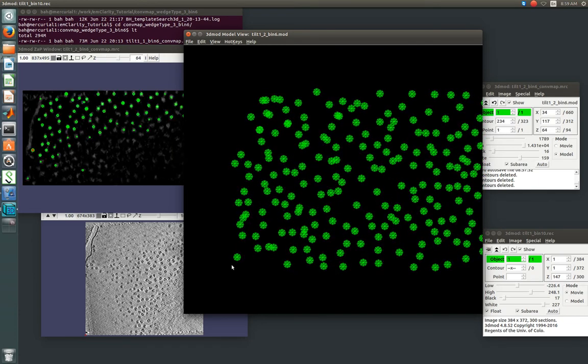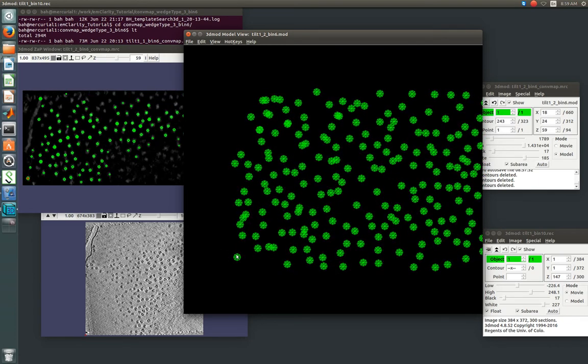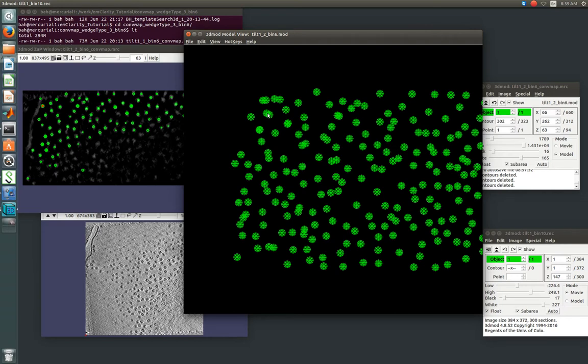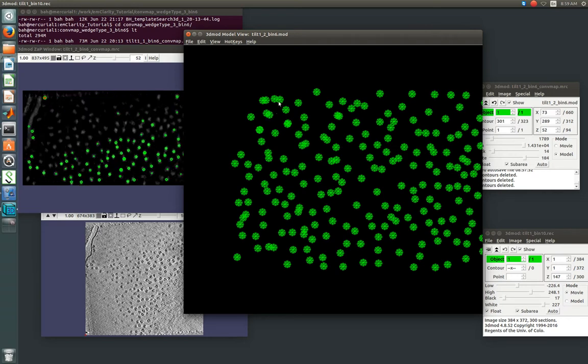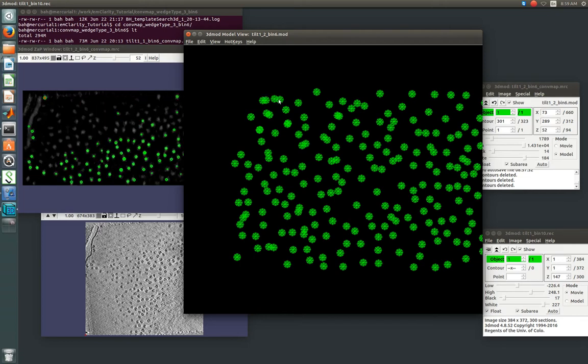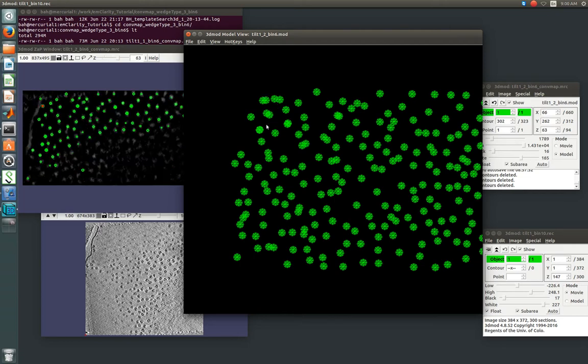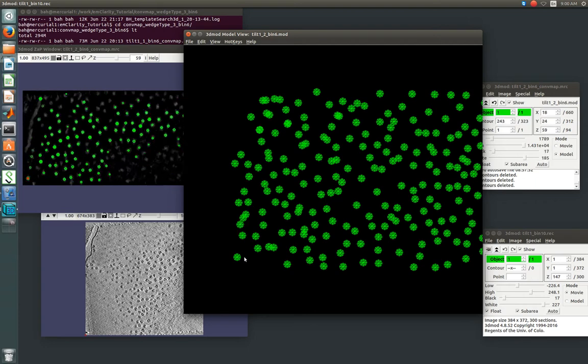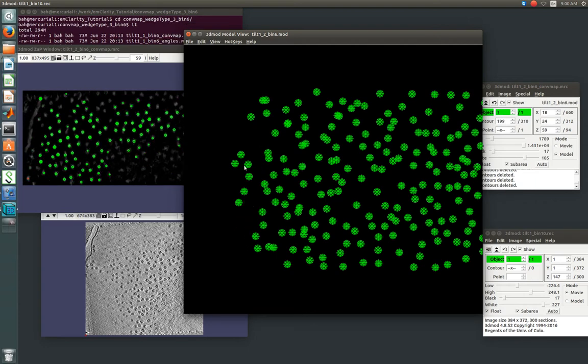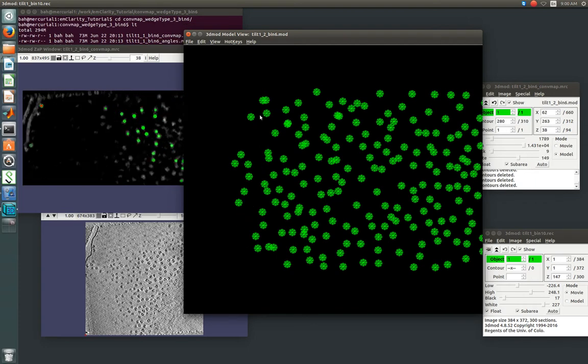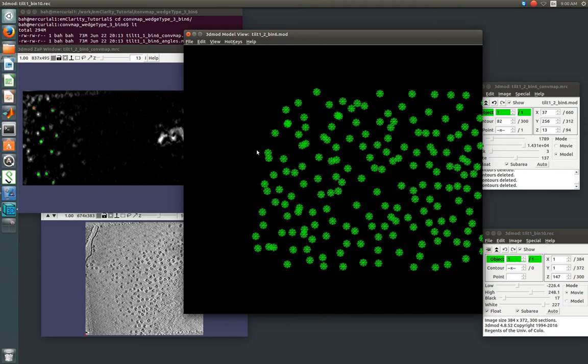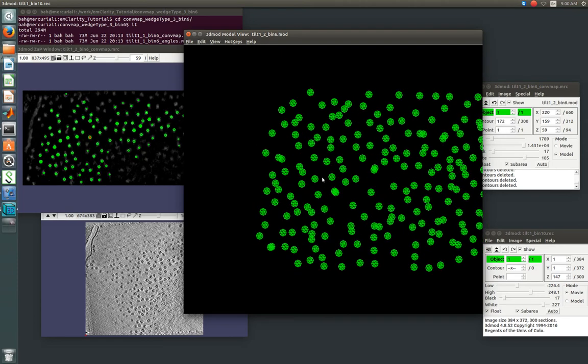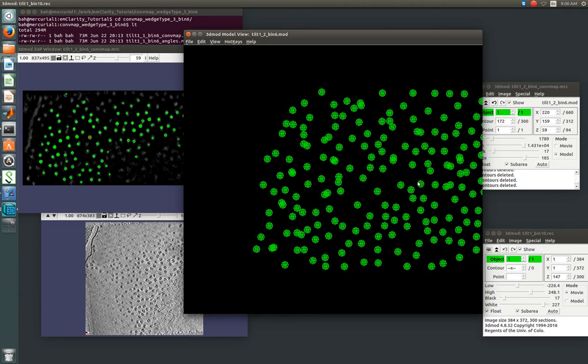Let me do a similar thing over here. We know that the carbon was along the left edge, and I'm going to pick just a few points at first, and look over at this left window as it changes, and make sure to sort of define a plane. And what I'll do, and this is a pretty good way to do it with membranes too, is rather than go necessarily outside in, sort of define a boundary with the ones you're confident in. And once you delete those, then it's a lot faster just to come in and get rid of all those guys.